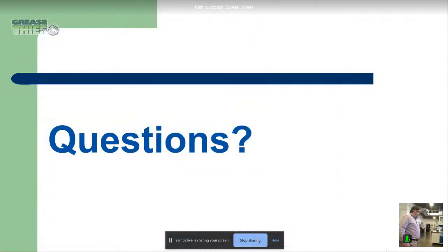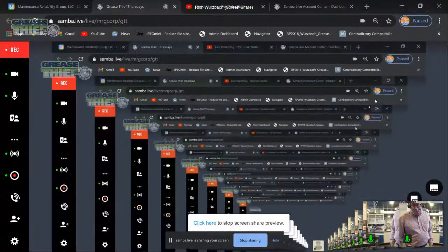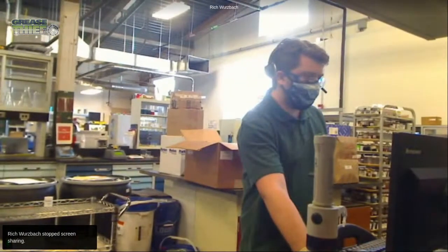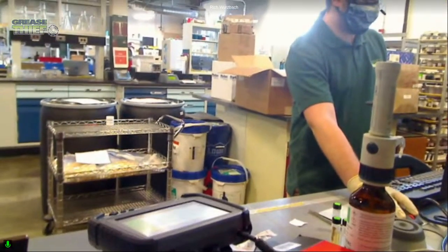So I got a slide up that says questions here, but I'm going to skip off of that for a moment. I'm going to pivot to Dylan so he can do a demonstration for us and show us how we're going to go through a grease-based evaluation of the ruler test. So I'm going to prop this up a little bit.